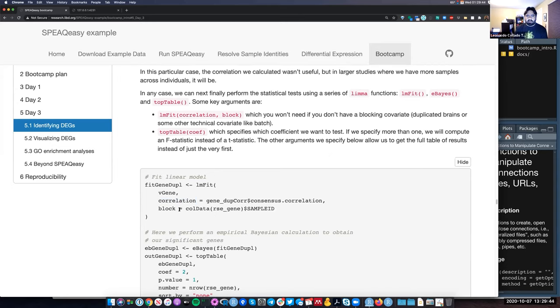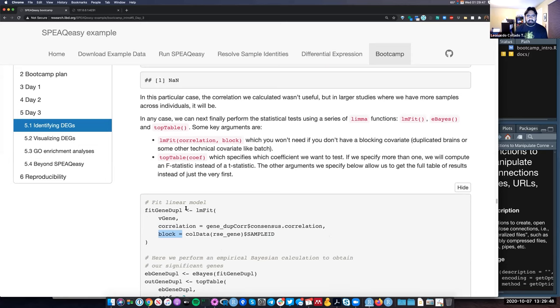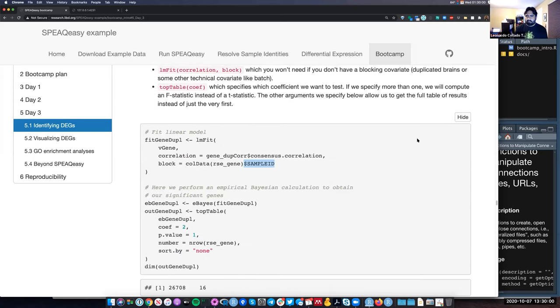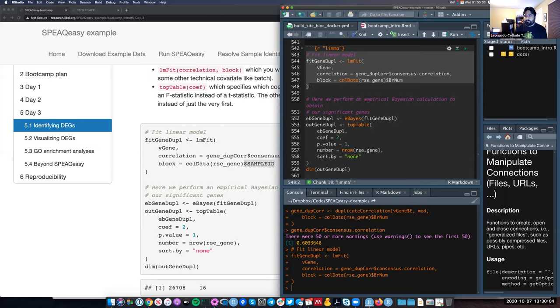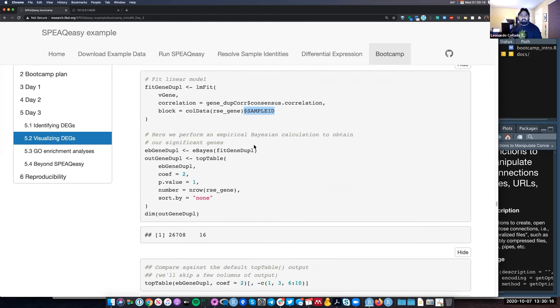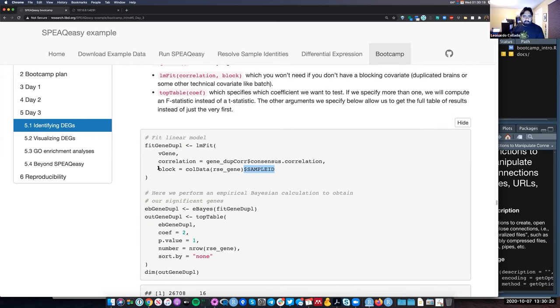By default topTable sorts the data and filters to only the top 10 genes, but we want all of them, so we specify sort.by='none' and number equal to the number of rows in our RangedSummarizedExperiment object. Our result from topTable — assigned to the object outGene — has 26,000 rows, because that's the number of genes that passed our expression filter, and 16 different columns. Below I'll run topTable again with just the coef argument so you can see how it looks by default.